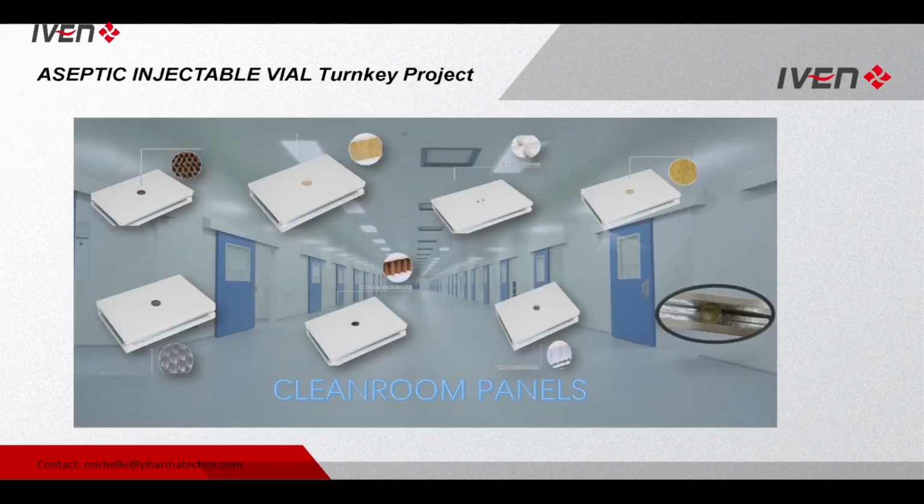And here I would like to introduce our clean room system. Before that, I would like to share our clean room panels. We have different kinds of panels for your selection, like paper honeycomb, rock wool, and glass magnesium. We will depend on your products, your requirements, and your regulation to give the best solution for the clean room panel.